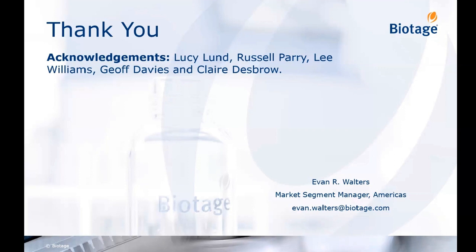So our first question is, can you utilize vacuum manifolds to perform the QuEChERS CSPE cleanups? Yes, that's a good one. Vacuum manifolds are very common. People typically already have them. They're low cost for SPE, so they actually can be used. We have protocols to help people use them.